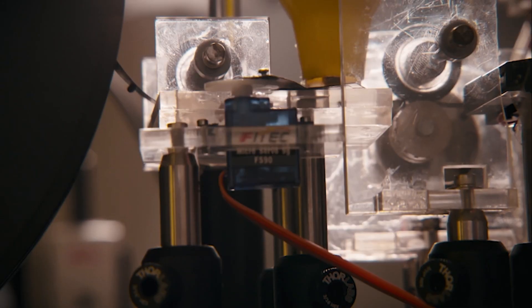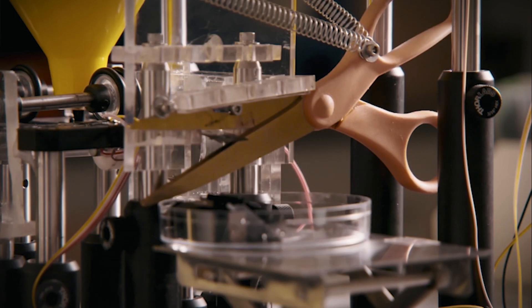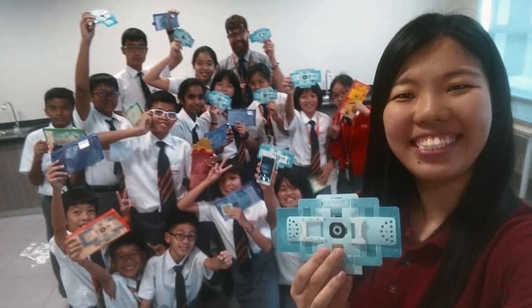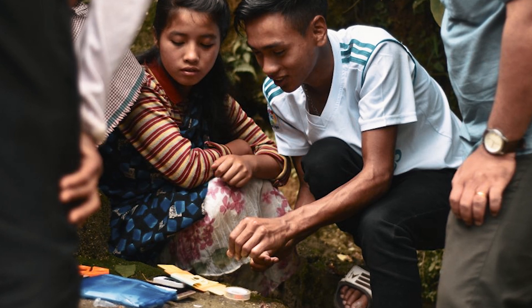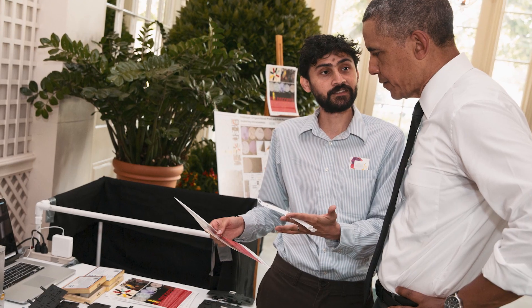It turned out we overshot — we made 75,000 of them. And so then we chose another harder problem, which is we're going to make 100,000 of them. Then we made a million. And now at this very moment, we are actively thinking about how to manufacture 10 million of them. At this point, we have made more microscopes than many 200-year-old companies in this space, primarily because accessibility is at the heart of what we do.